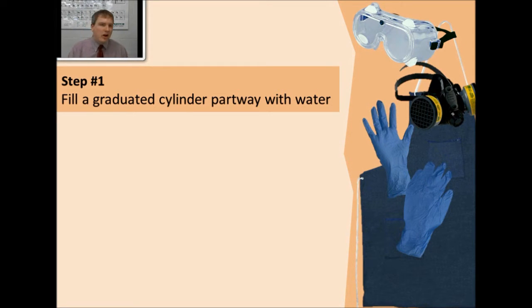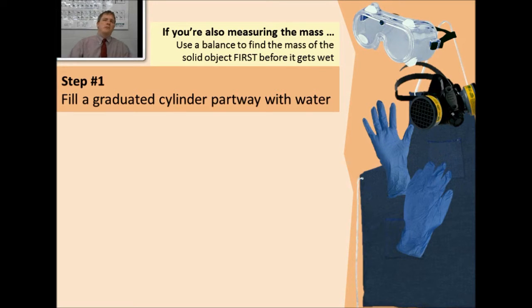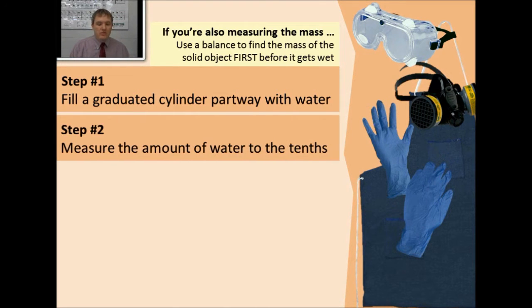Now that we've filled our cylinder with water, we're almost ready to put an object into it. But first you have to ask yourself, am I also measuring the mass of the object? If I want to measure the mass of an object, I want to make sure I do that first before I put it in the graduated cylinder because its mass is going to change when it has water molecules clinging to the outside of it. You want to make sure that if you're going to measure the mass, you do that before you put the object into the graduated cylinder full of water. Step two is to measure the amount of water that you start with in the graduated cylinder in tenths. You're measuring to the tenths place of precision.